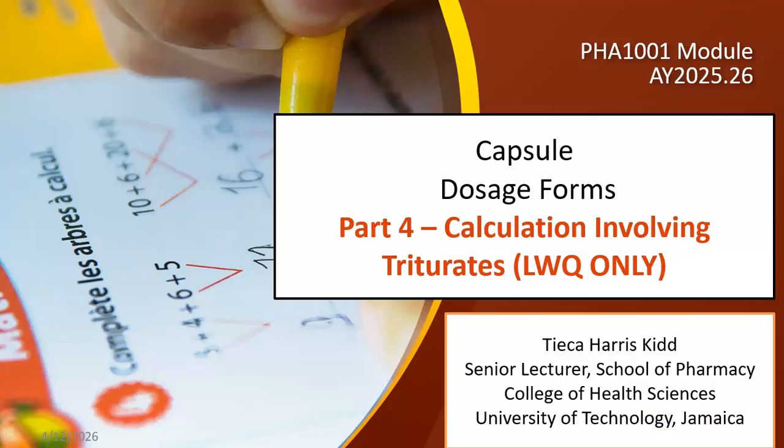Welcome to part 4 of calculations regarding capsule dosage form. In this video, we are going to look at a very unique request, making capsules for a drug that is less than the least weighable quantity. Don't be fearful of the concept.